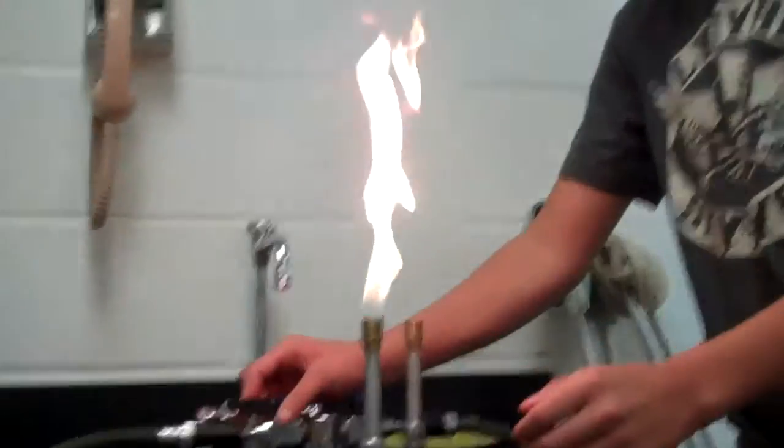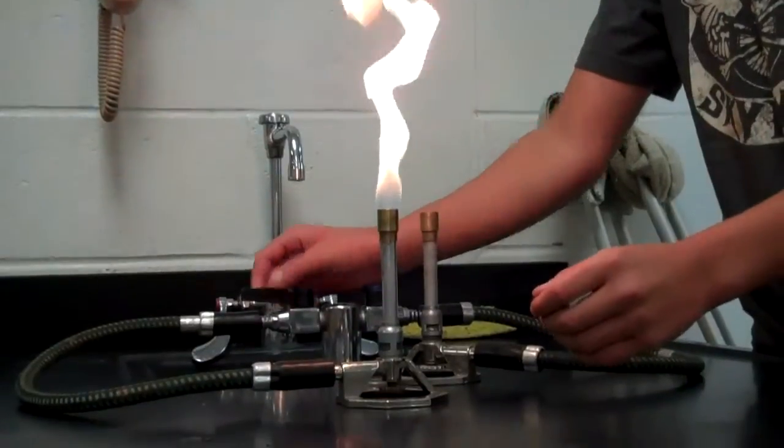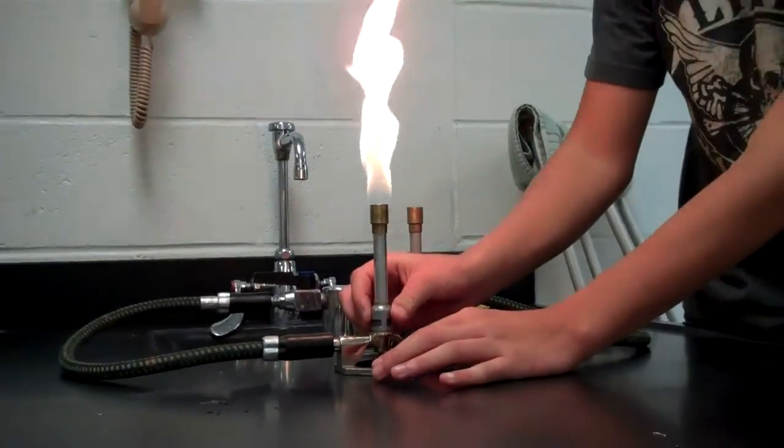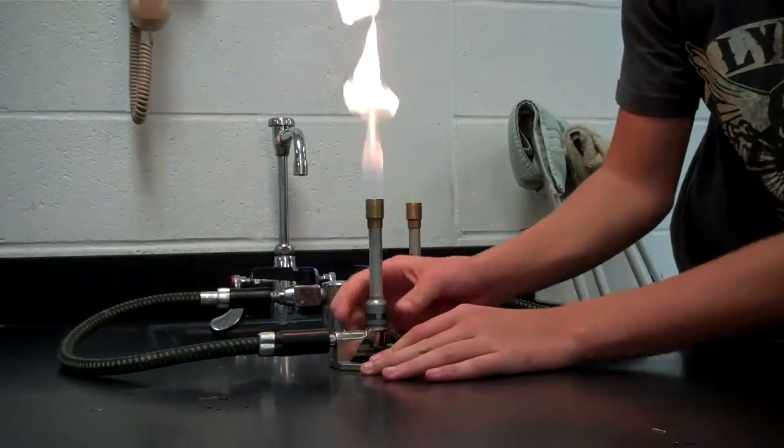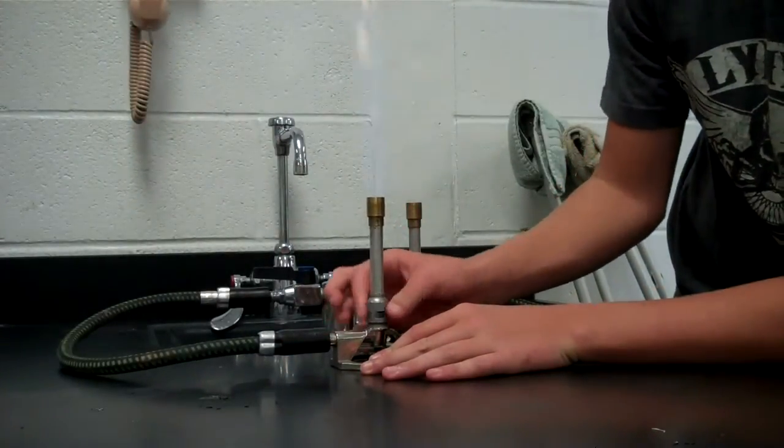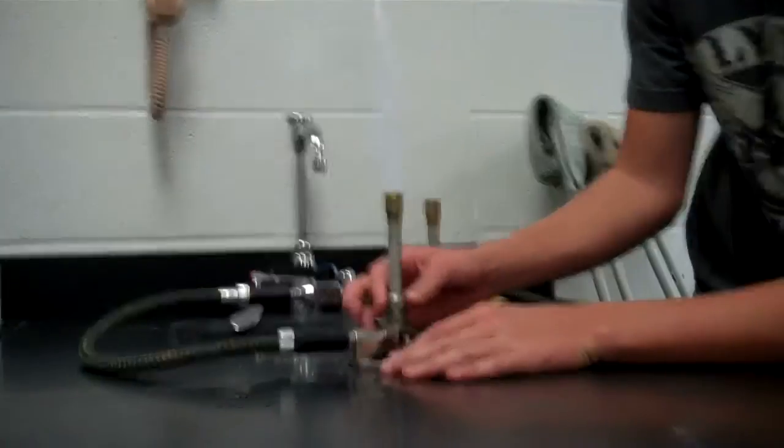You can play with the flame by making it smaller and bigger. The red flame doesn't have as much air to it. If you want more air to it, you unscrew it. When you unscrew it, it turns to a more decent flame. It's hotter.